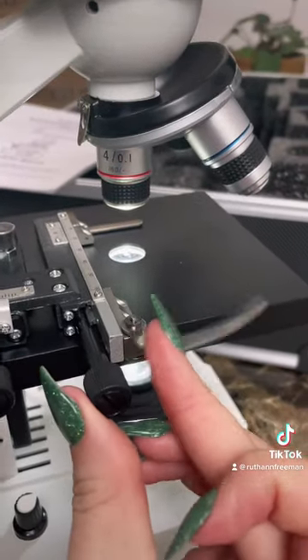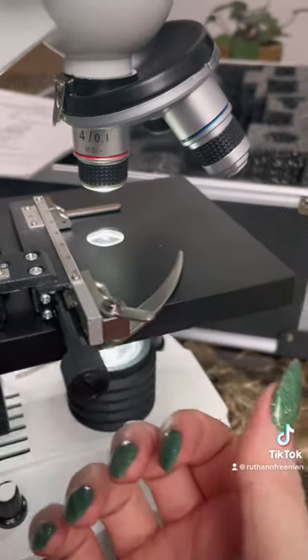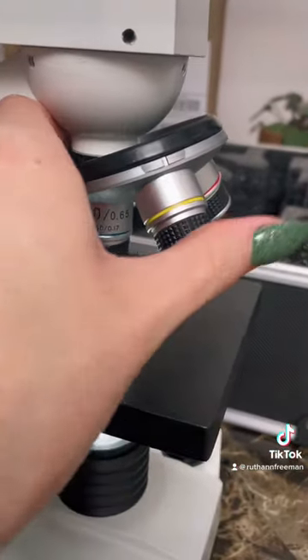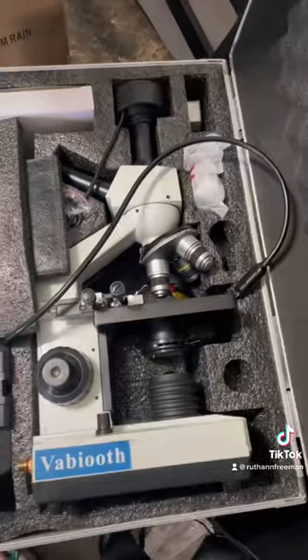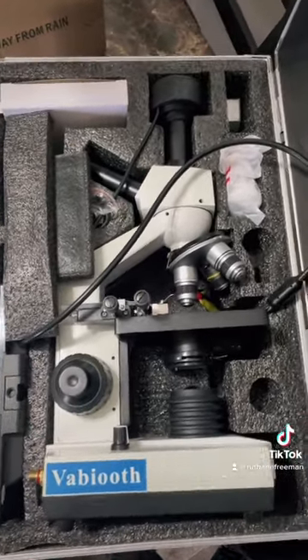Many of the parts just seemed like they weren't functioning properly, and I couldn't get anything to focus except for the smallest lens. I thought the focusing was user error, so I sent troubleshoot videos to my friends and they said I was doing it right. In conclusion, it just wasn't working and I had to return it.